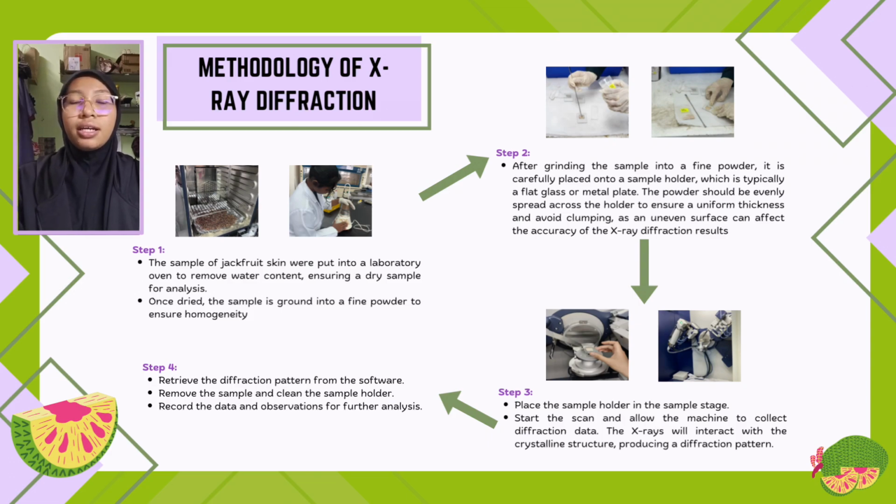And finally, the data is analyzed. After the scan is complete, the diffraction pattern is retrieved from the software. The sample is removed and the sample holder is cleaned for future use. Lastly, the data and observations are recorded for further analysis.